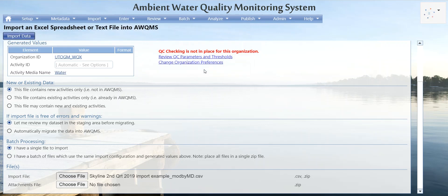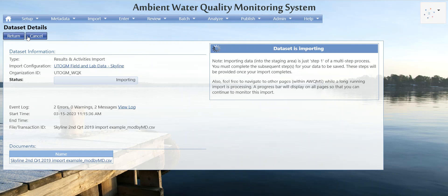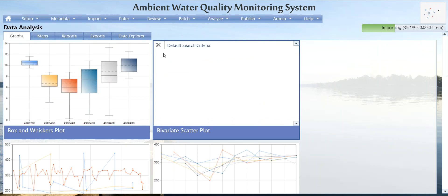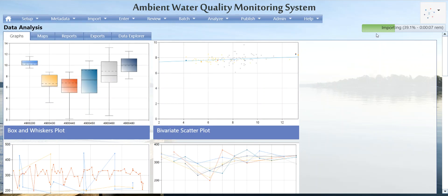I'll go ahead and choose my file, click Open, then click Import Data. You get a message that the data set is importing. You can navigate away and do other things in Aquums — you'll see a status bar up at the top. We'll wait to see that it's imported and then click back into it.